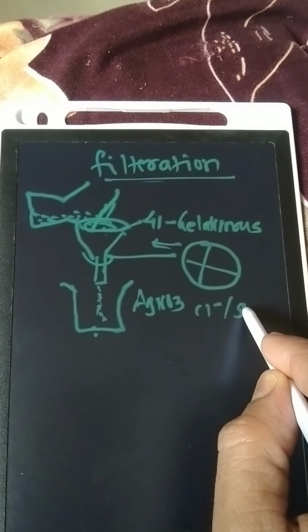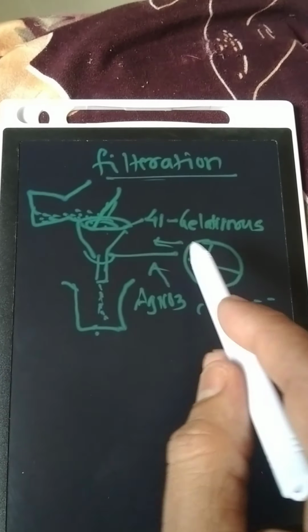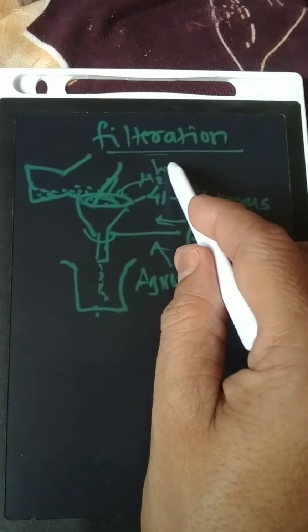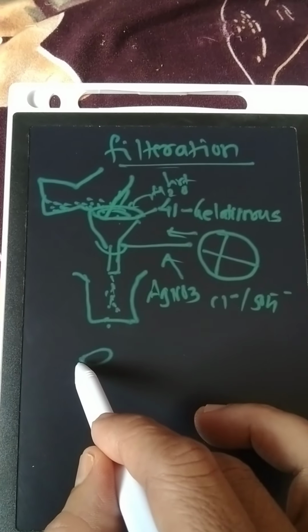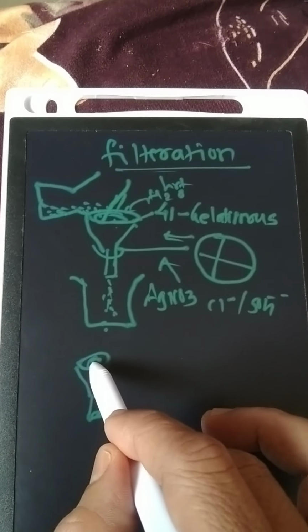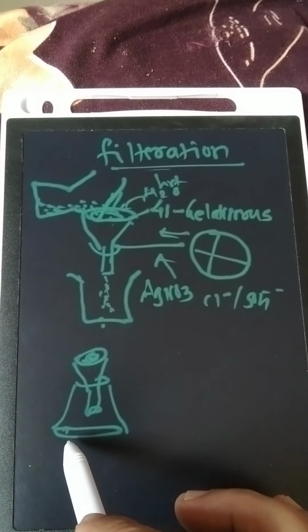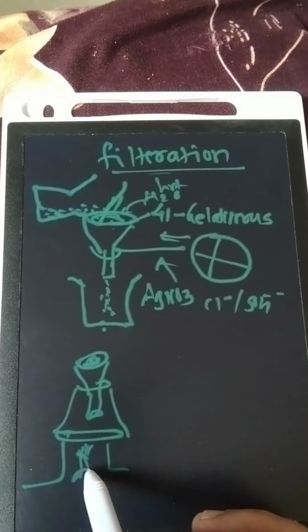If sulfate ions are present as impurity ions, that occurs in the co-precipitation process in the precipitation step. So that is removed by washing this solution with hot water, and washings are also collected. Then this funnel containing the Whatman paper and residue of Fe(OH)3 is heated over an air cone or a drying cone placed on a wire gauze and burner for some time.